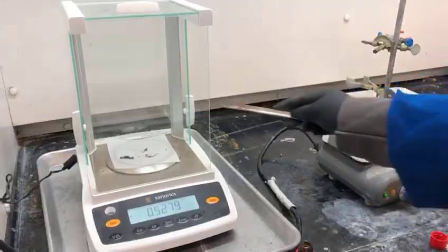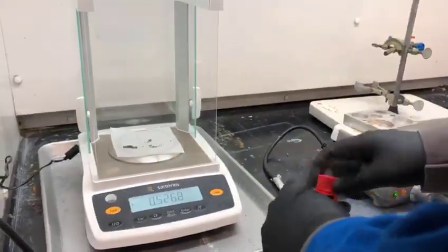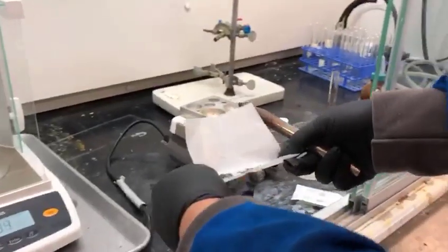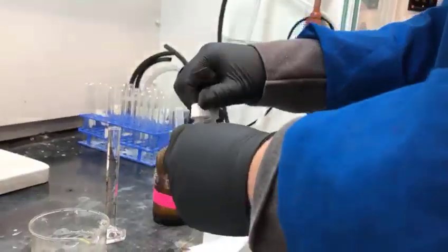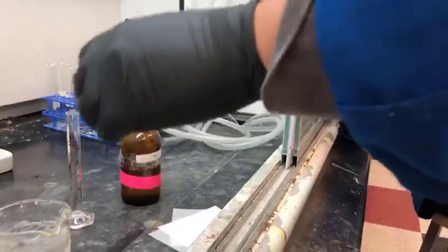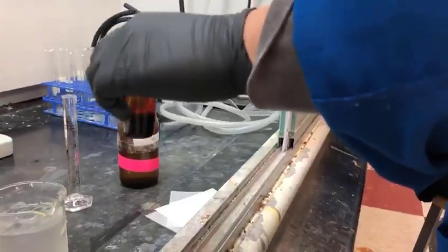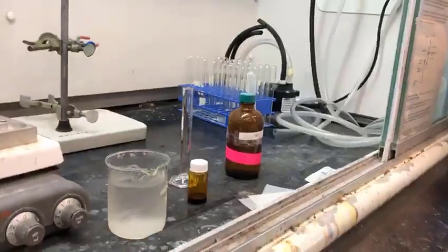Here you will see the TA is weighing out an appropriate amount of iodide crystals. The TA has weighed out approximately 0.526 grams of I2, and the I2 crystals are being added to a vial that contains approximately 2.5 milliliters of THF.